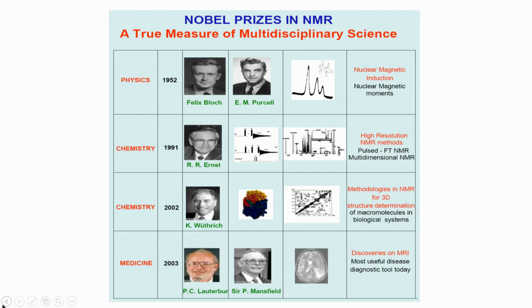of this particular course, where we will see how NMR techniques have grown in recent years. They are fascinating techniques, very nice approaches which can tackle challenging systems, which is not possible even by any other techniques, including X-ray crystallography or cryo-electron microscopy.